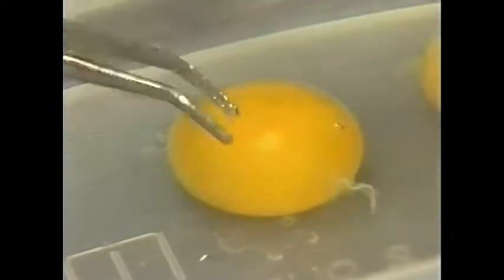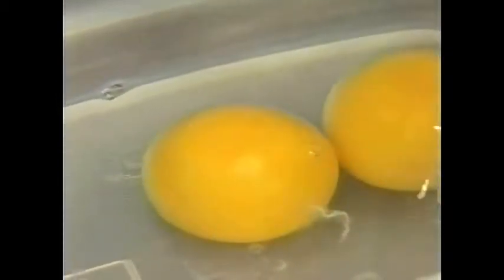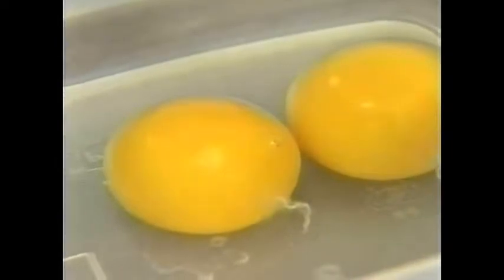Identify that germinal disc. Make sure the yolks are submerged all the way under the solution, as the salt solution helps get some of this albumin off. Once we find that germinal disc area, we'll make a little puncture away from it and cut off the perivitelline layer or perivitelline membrane that overlies that yolk — about a centimeter or a little more, so that the germinal disc is in the middle of that perivitelline layer piece we cut.